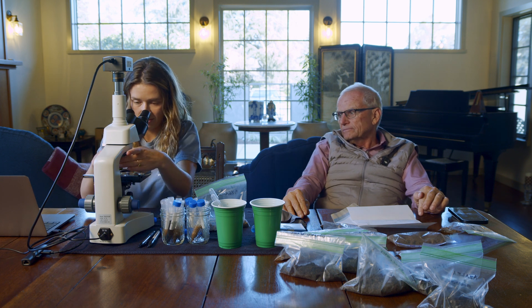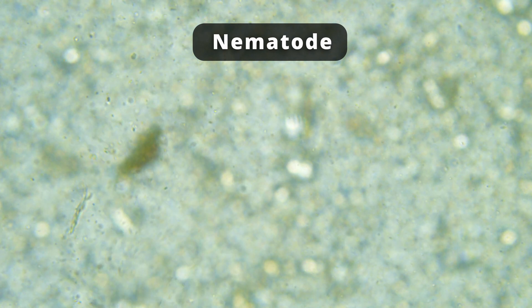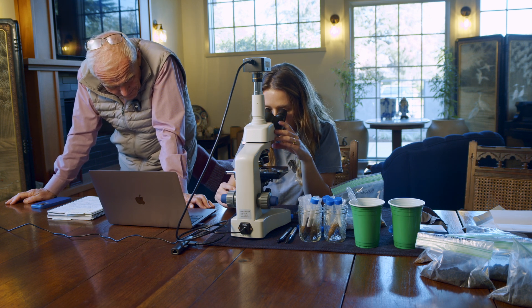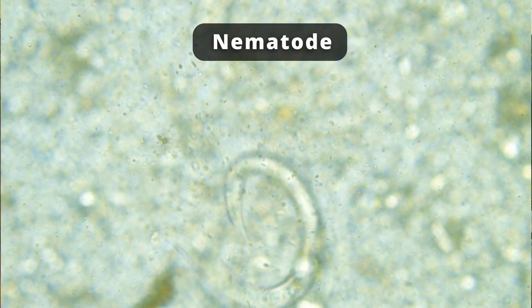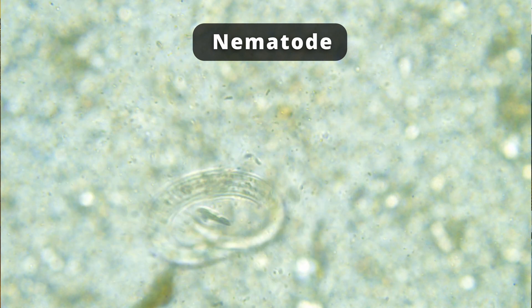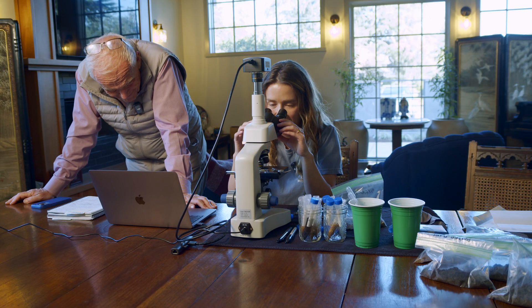Just found a nematode! So we're going to zoom in on this guy. There's a lot of bacteria too, which makes sense. He's really moving fast — faster than any of the other ones we've seen today. Look at him go, he's wriggling around. Yeah, that's a good sign. It is a good sign that there's movement, because if you see dead nematodes you might want to think twice about why. This one's a bacterial feeder — you can see little green bacteria inside its see-through body, which makes it pretty cool to see the digestive system. We could watch this all day. We're just nerding out right now — excuse us — but that's so cool.